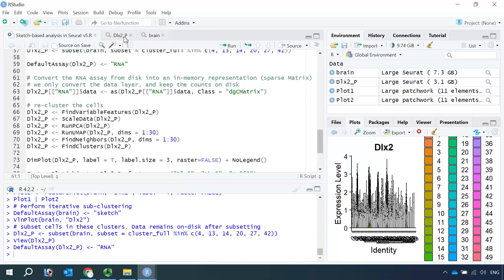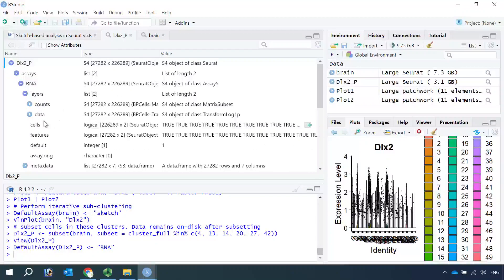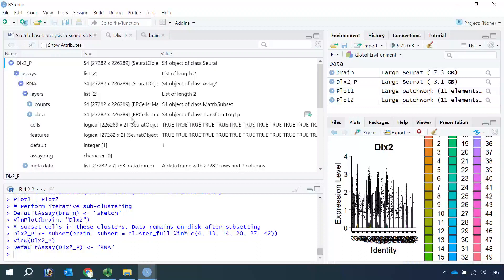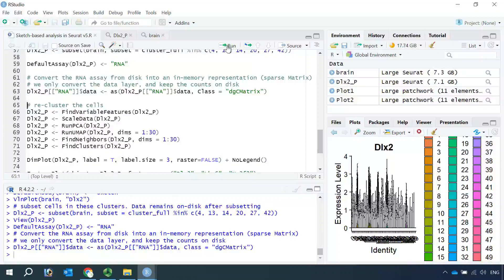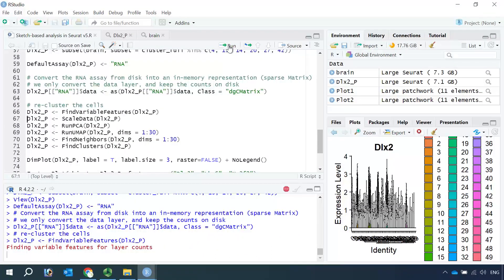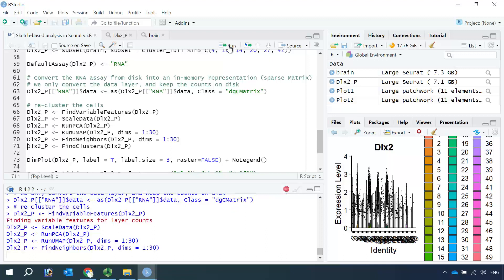The full dataset was saved on disk, so we need to convert the RNA assay from disk into memory. Let's have a look at the DLX2P object again. You can see in the assay RNA we have two layers: one layer is counts, the other layer is data. The counts layer saves the original matrix data on disk, and the data layer saves normalized data on disk. So we just need to convert the normalized data layer from disk into memory. Now we can perform the standard workflow again for all the DLX2-positive cells: find the variable features, scale the data, run PCA, run UMAP, find the neighbors, and find the clusters.